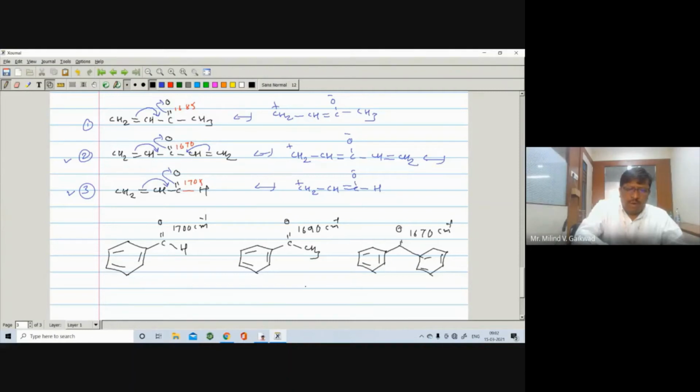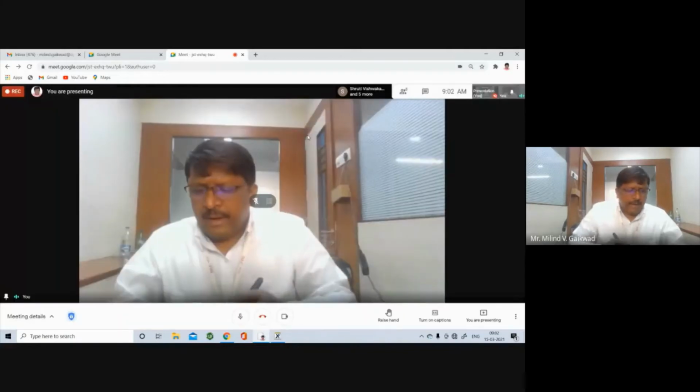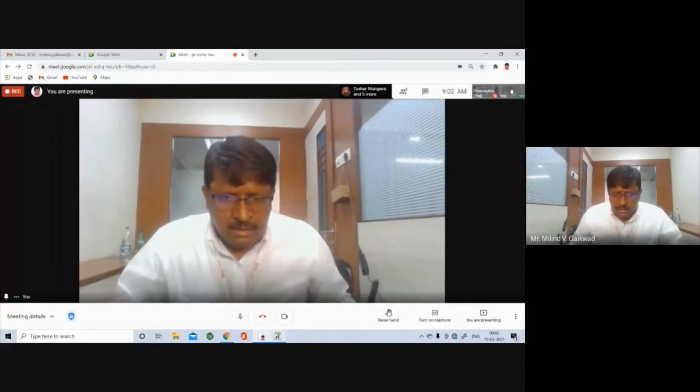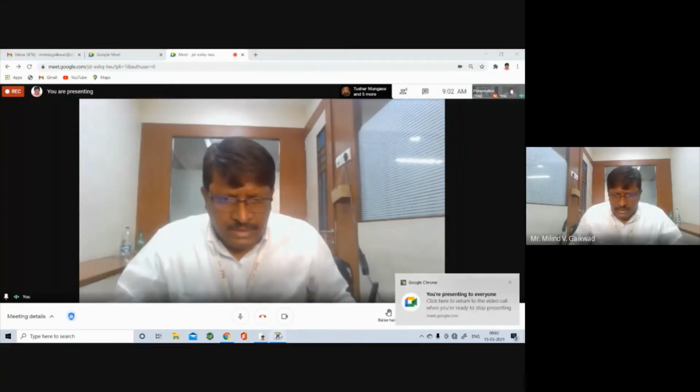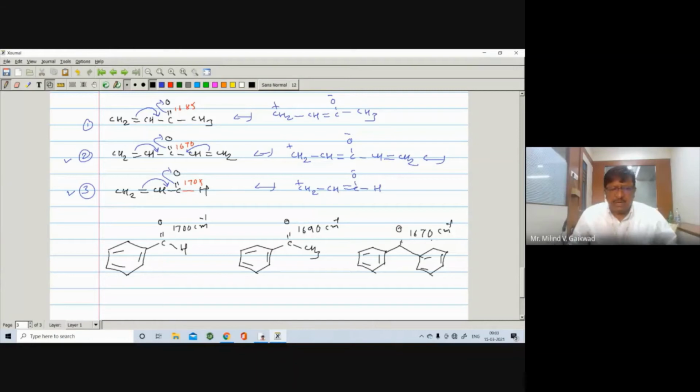As there is more crowding, it appears at the frequency 1690, and again there is the presence of two benzene nuclei, so again there is more crowding, and it appears at a lower 1670.